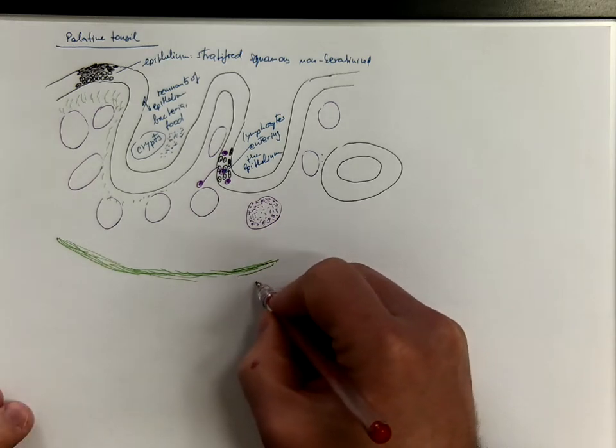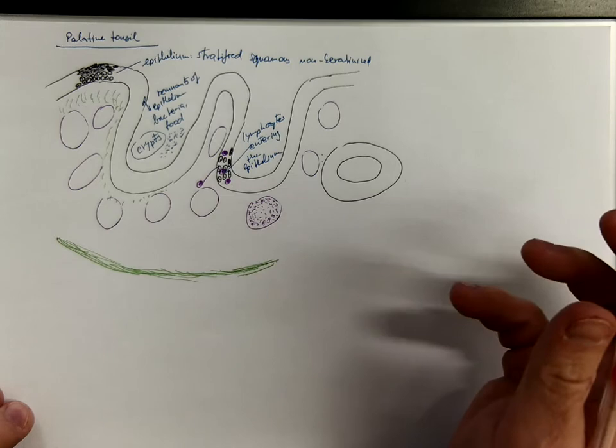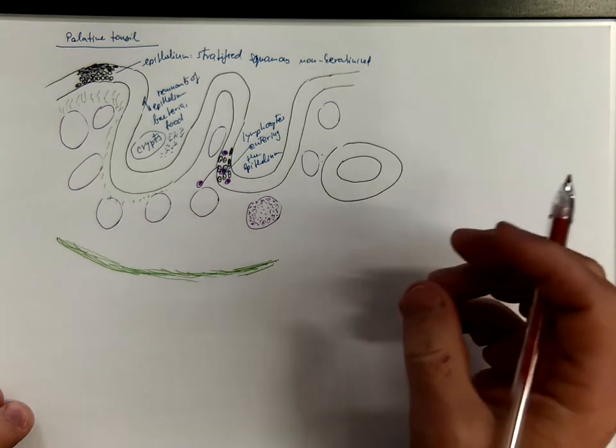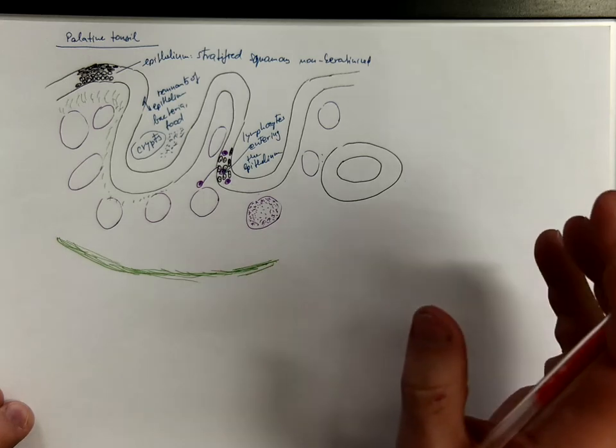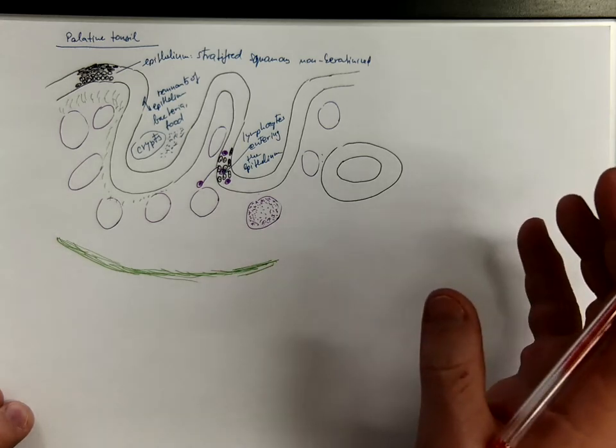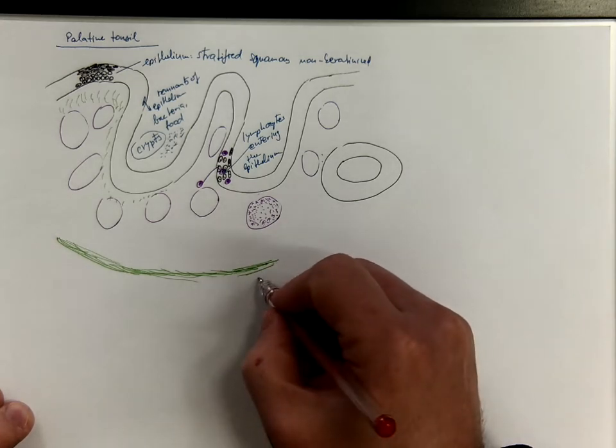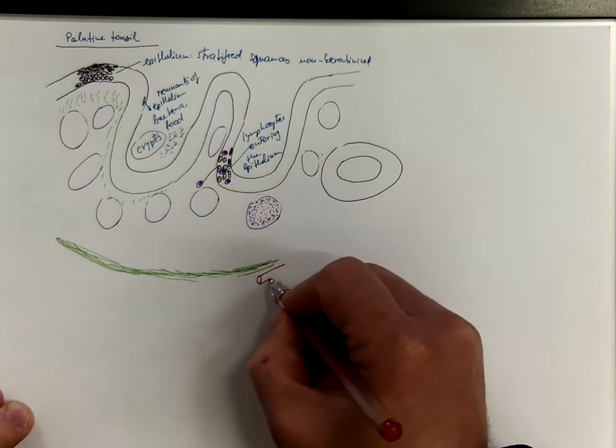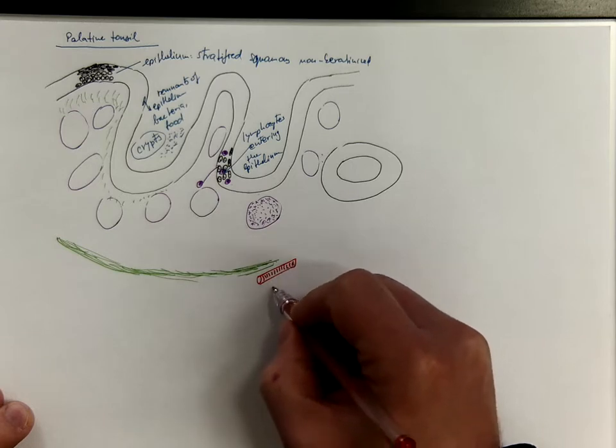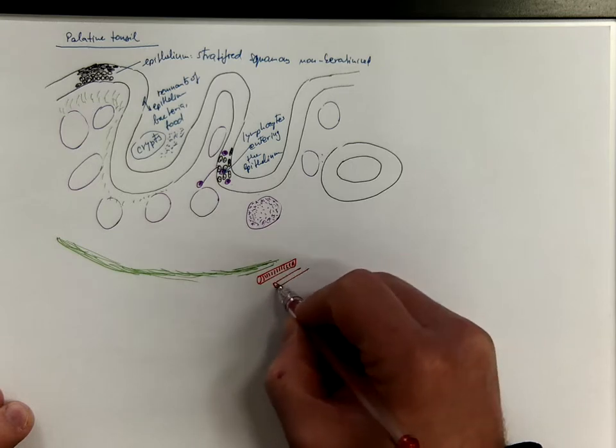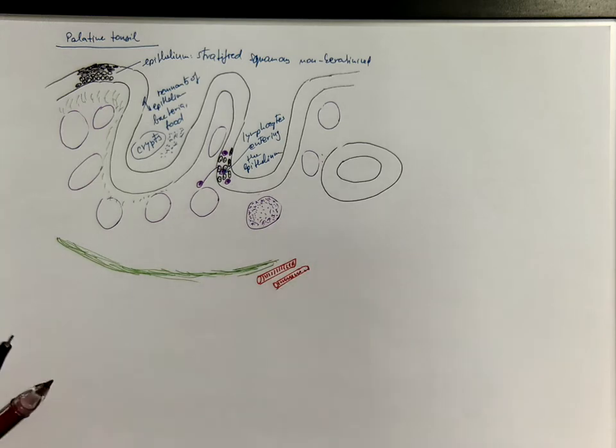Outside the palatine tonsil you can find some skeletal muscle fibers. Usually they belong to the palatopharyngeal or palatoglossal muscles. That are surrounding the tonsillar fossa, which is the anatomical space where you can find the palatine tonsil.